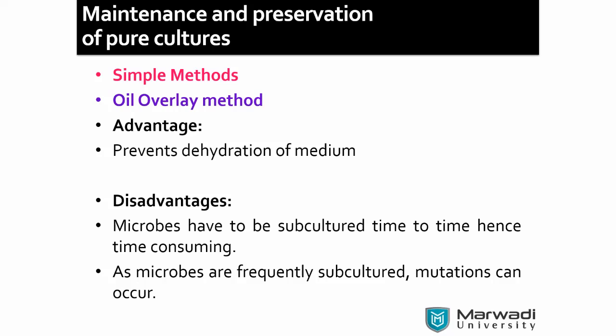If you are using this oil overlayer, it prevents the water from moving out. So it can be stored for a longer time period, maybe about 6 months. Okay, the same slant is there, and overlayering is done.